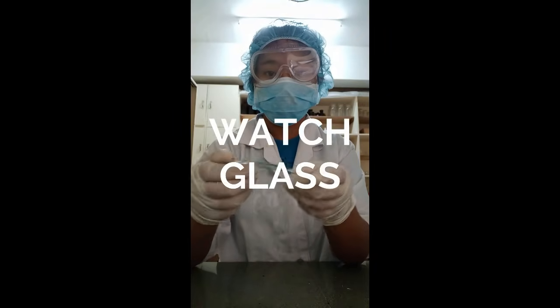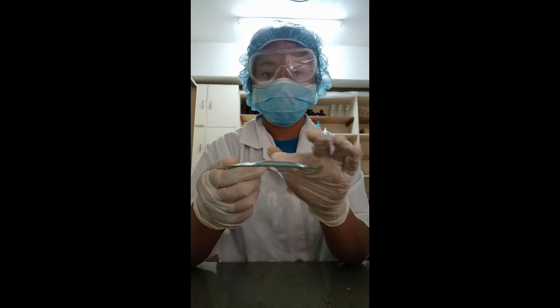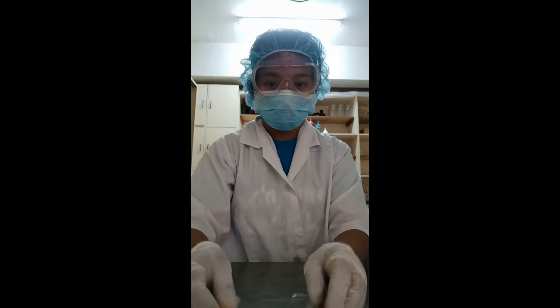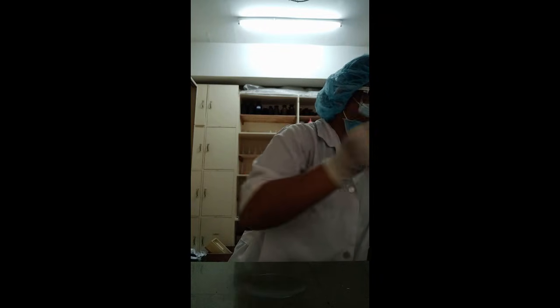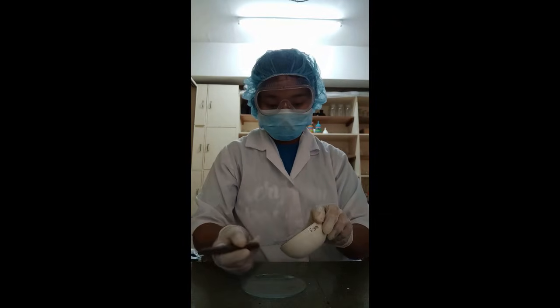Watch glass. It is a round piece of glass that is slightly concave or convex. It holds a small amount of liquid or solid. It is a lid for a beaker and is used for evaporation purposes.